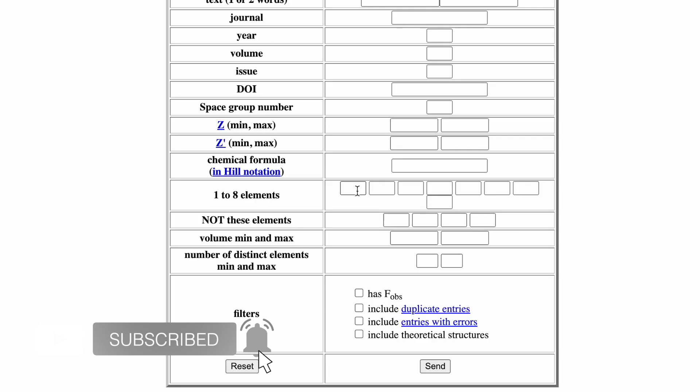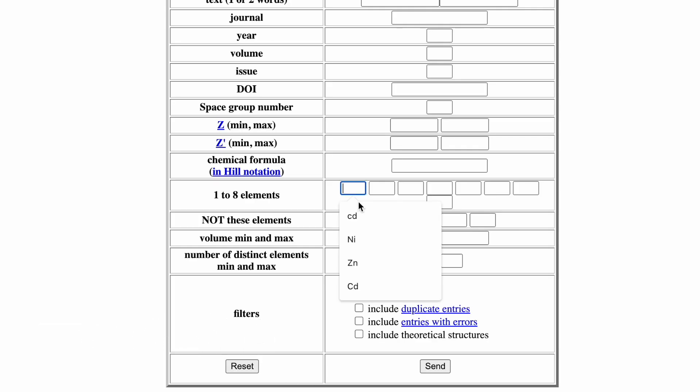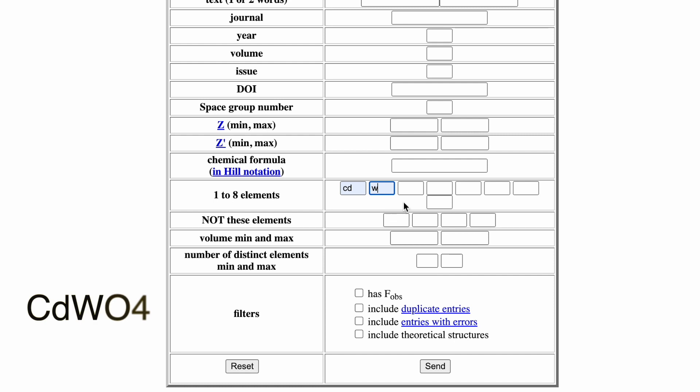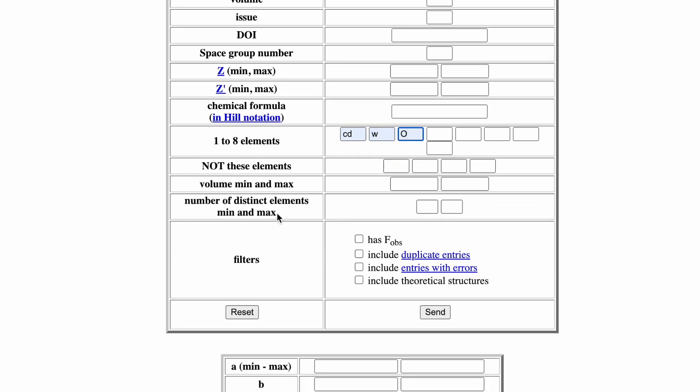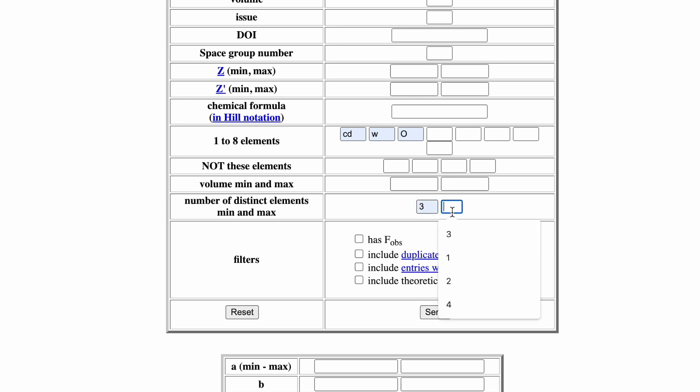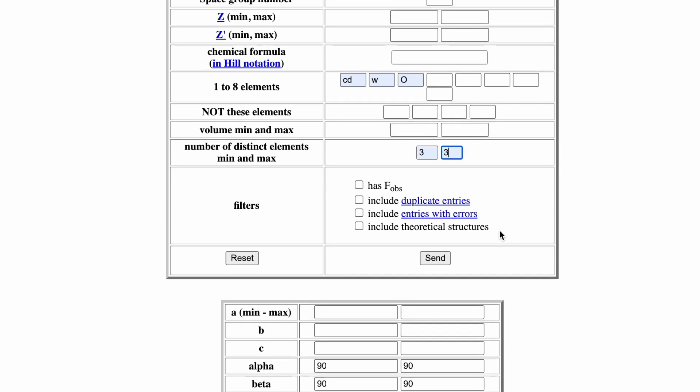Let's consider an example of CdWO4. It has the elements Cd, W, and O. The number of distinct elements, minimum and maximum, is three minimum elements and three maximum elements. Now click on search.